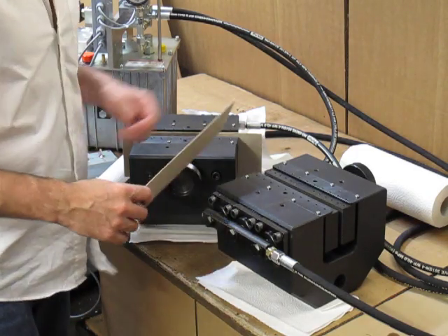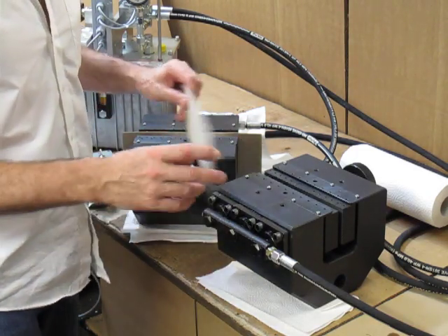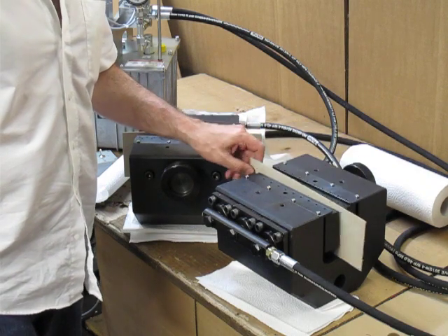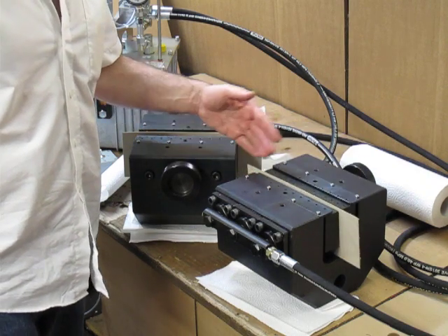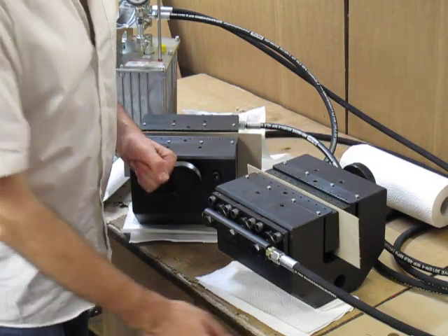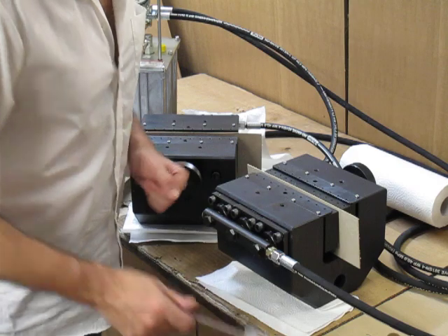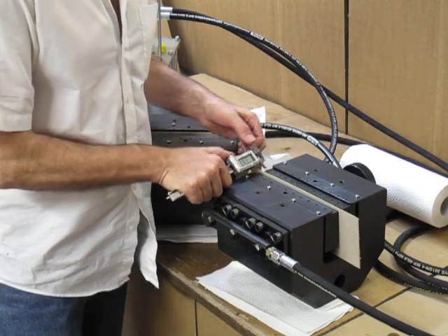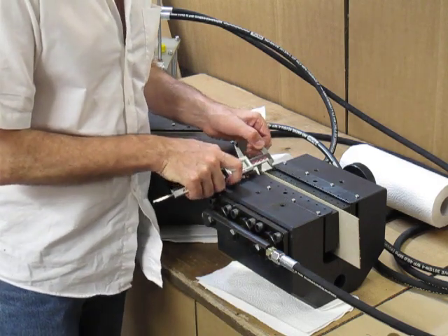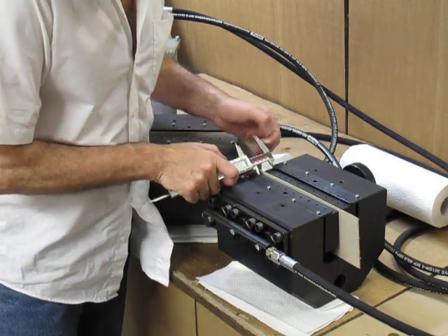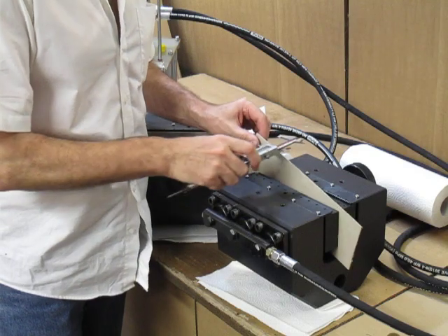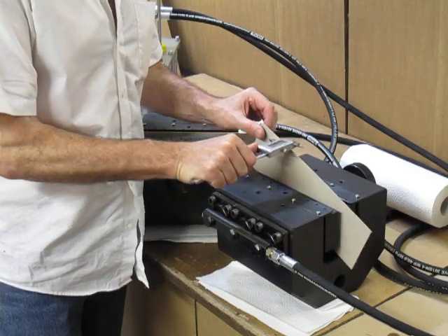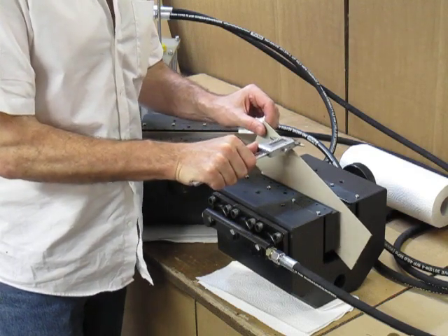The next step is to test the grip with a sample and center the grip. Here we have a distance of 40 mm. This sample has a thickness of 1 mm.